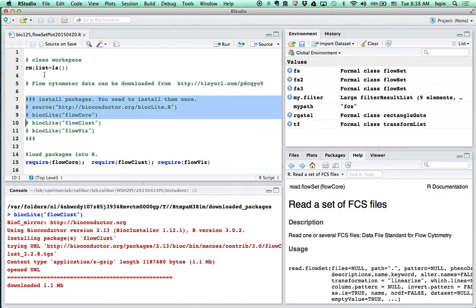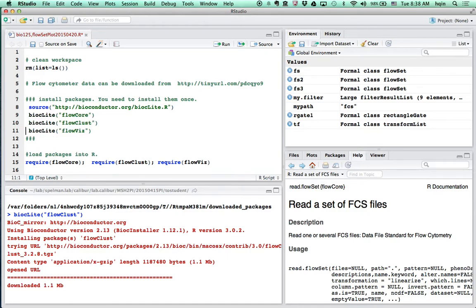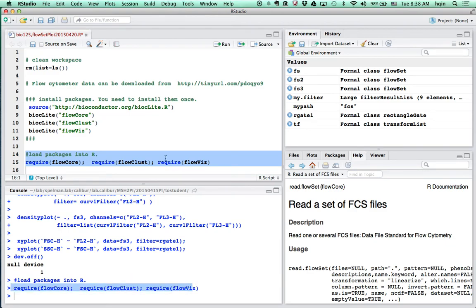If you have not installed the R packages, you should install those packages by uncommenting those lines in front of them. I have installed those on my own computer, so I will just load them. At the bottom, you see those have been loaded into R.